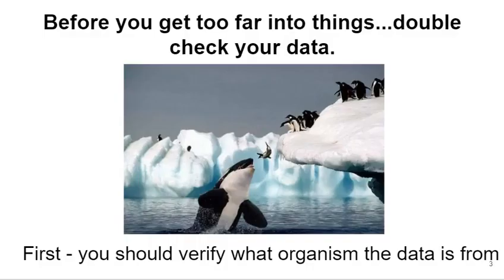Before you get too far into things, you should double-check your data, because up until this point you haven't been able to look at anything other than A's, T's, C's, and G's and their associated quality data. Generally, when you send samples off to the lab, what you sent off gets sequenced and that's what gets returned to you. But things can go wrong, and samples can get mixed up. You don't want to get too far into an analysis without knowing that what you're analyzing is actually your own data — not a contaminant from the lab or your own DNA that accidentally got into a sample.